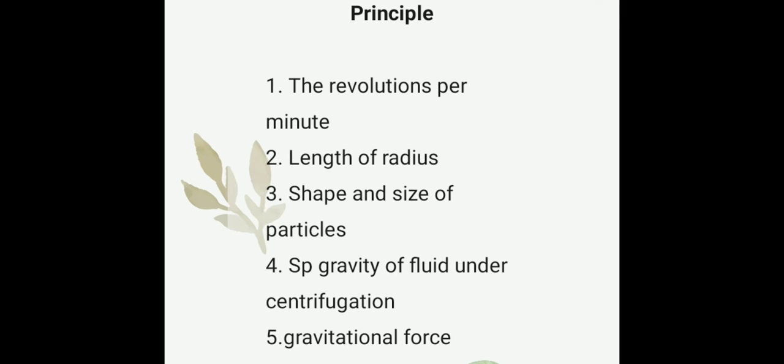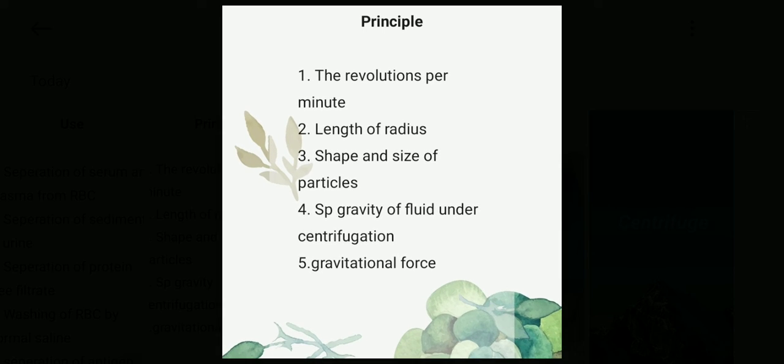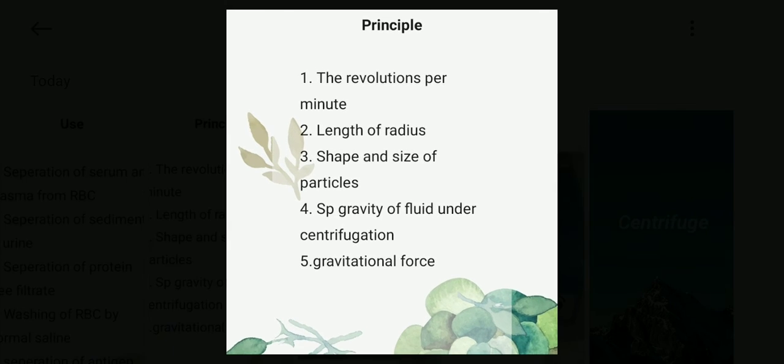Number 3. Shape and size of the particles. Number 4. Viscosity and the specific gravity of the fluid under centrifugation. Number 5. Gravitational force acting on the particles.